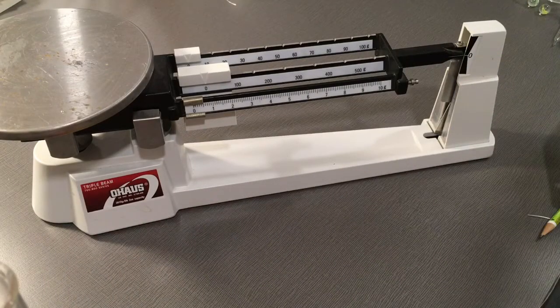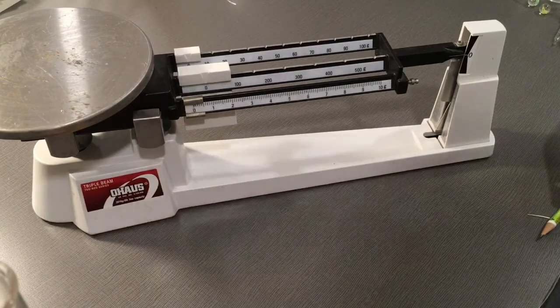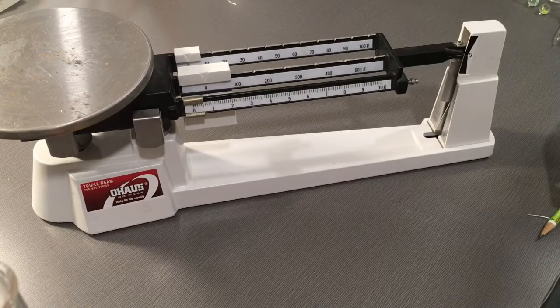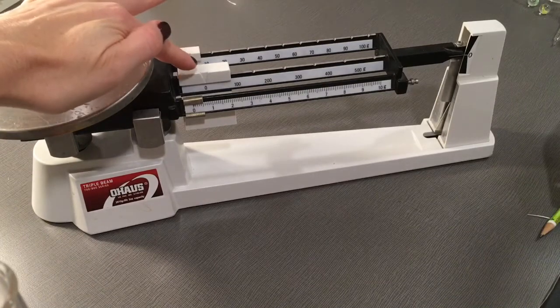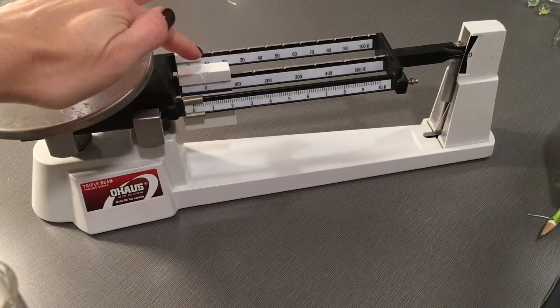Okay, let's look at page 2, where we are going to determine the mass of each of our samples with the triple beam balance. When you have your triple beam balance, make sure that all of these riders are on the 0 mark. Just as a reminder, you start moving the largest rider first. That is in increments of 100 grams.